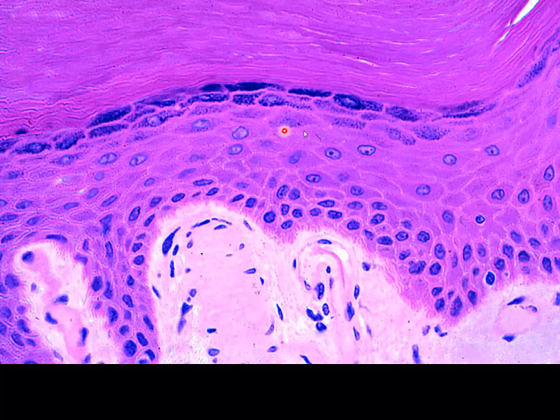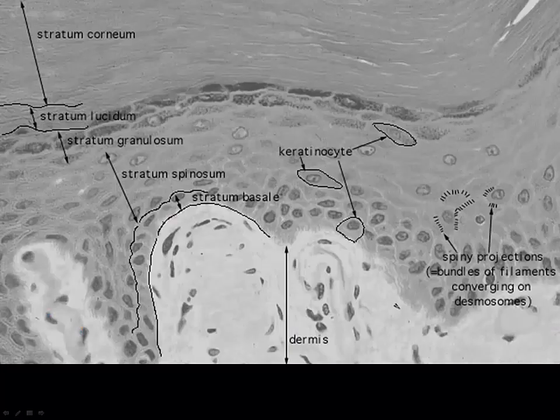Most of what you're seeing here are keratinocytes. This cell is either going to be a Merkel cell or a melanocyte. And I don't really see melanosomes, that darker color around them. So I'm going to step out and just say we've got a Merkel cell there. And they don't name it. Well, we'll call it Merkel.